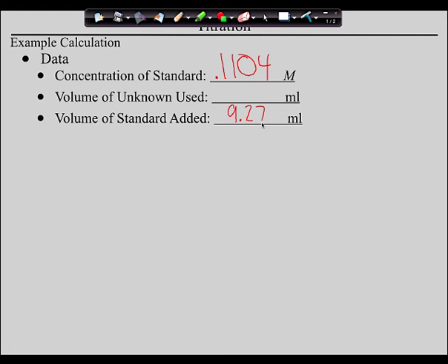What was the volume of the acid? 10 milliliters. But guys, remember with our graduated cylinder, we always measure tenths, estimate tenths. So we'll go 10.0. You good? Okay, so guys, that's it. That's all we need.